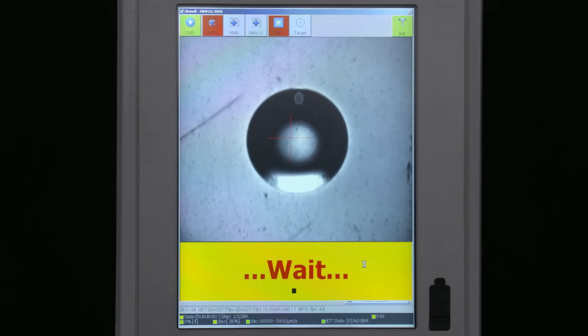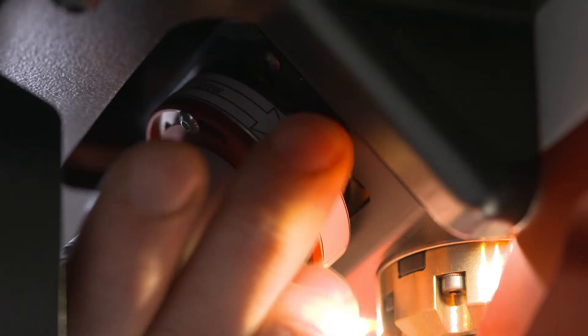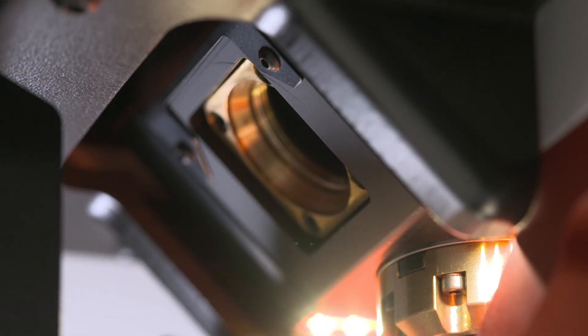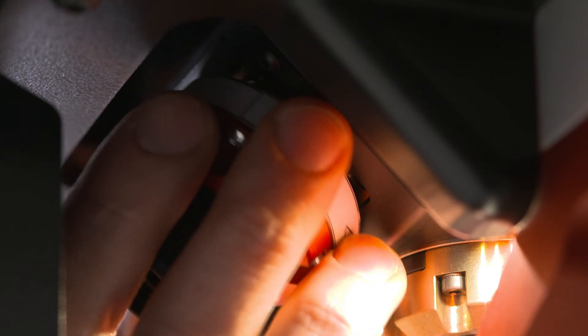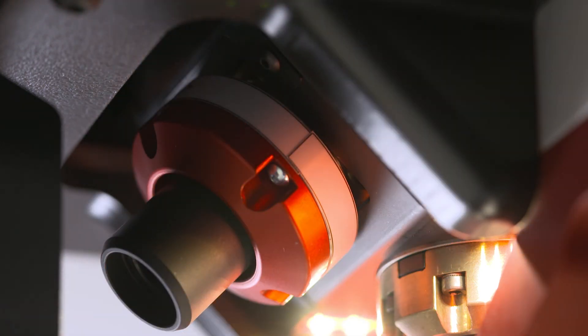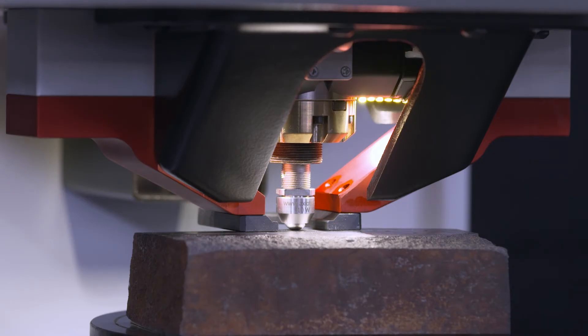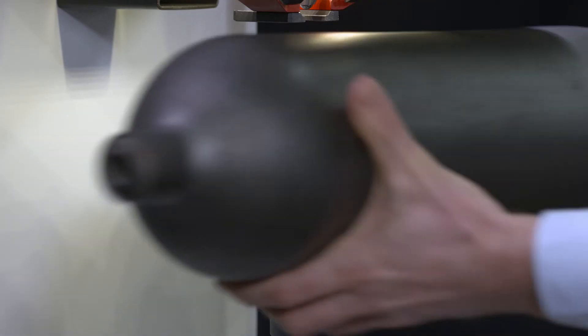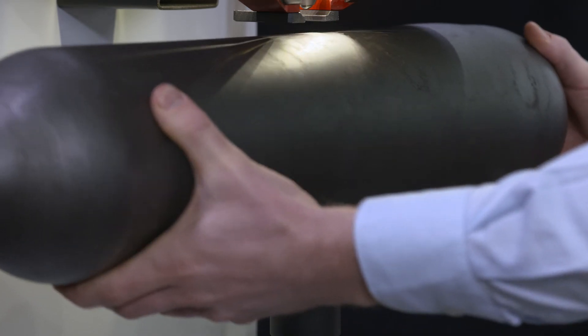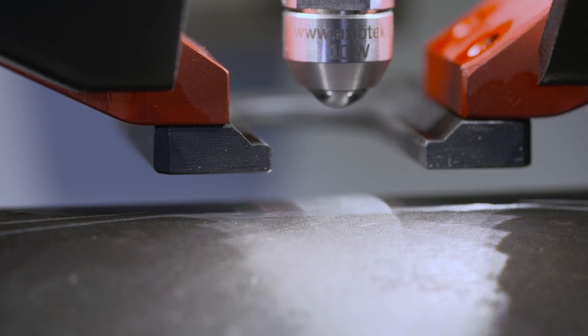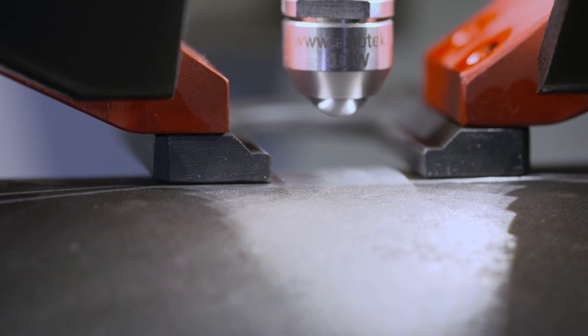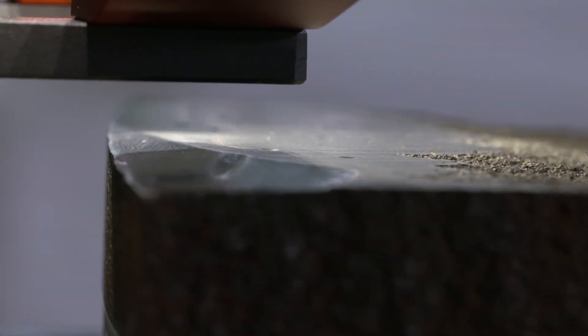AFRI's proprietary image analysis for indentation reading and the autofocus system eliminate any variables. The clamping system holds the sample in place prior to testing, ensuring perpendicularity and stability during testing. Extremely precise results can be obtained even on unbalanced or heavy pieces.